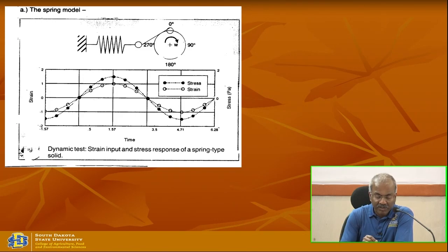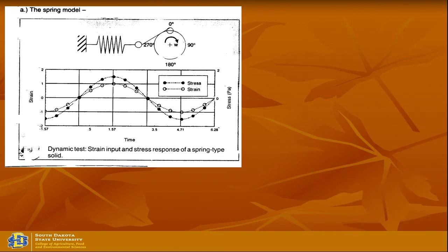As you input the strain you are measuring stress. The stress response is the solid circle, that is what you see here. So this is the dynamic test, strain input and stress response for a spring type solid, the spring model.